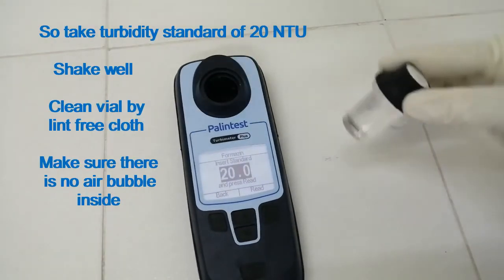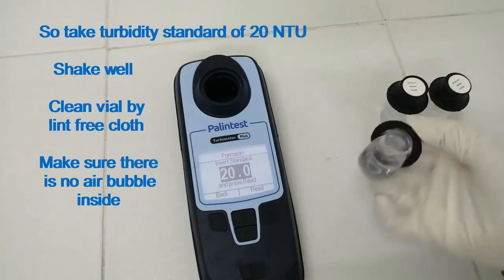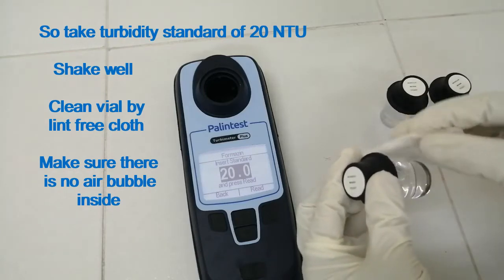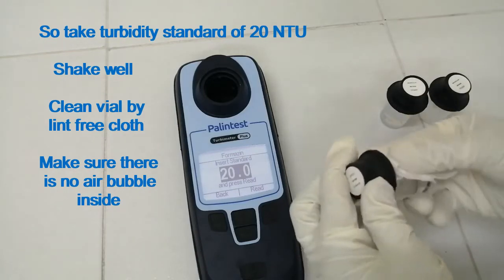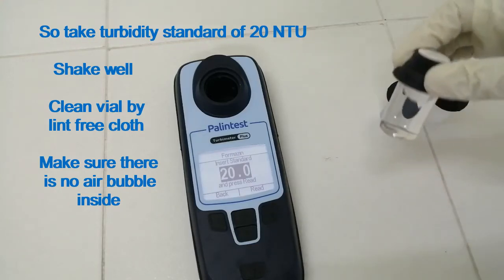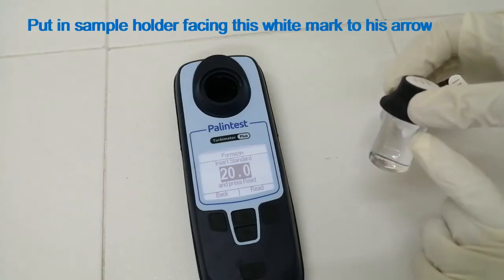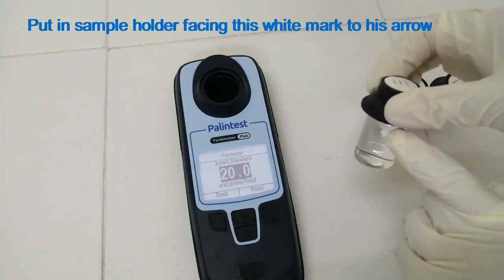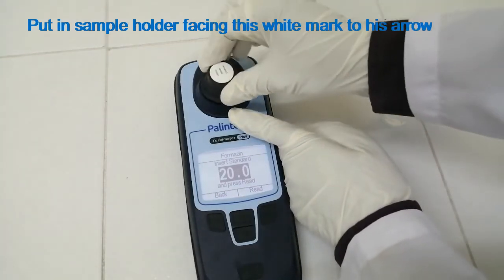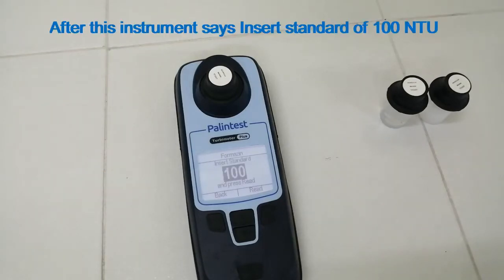The instrument then says: insert turbidity standard of 20 NTU. Take the turbidity standard of 20 NTU and shake well. Make sure there is no air bubble inside the vial. Put it in the sample holder facing the white mark to the arrow. Now press Read from the keypad. After this, the instrument says: insert standard of 100 NTU.